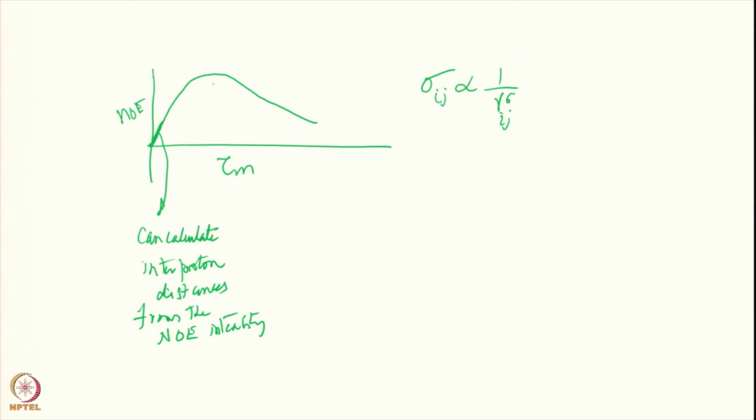If we go beyond that, the NOE intensity is no longer restricted to that, it will start diffusing to other spins. So the relaxation, individual coupling between all the spins will come into the picture, and you may not be able to do it. Therefore transient NOE is an experiment which is done in a controlled manner. You can control the extent of diffusion that can happen from one spin to another spin, and that is an extremely useful parameter for calculating the structures of molecules.